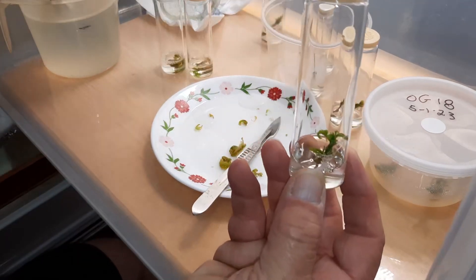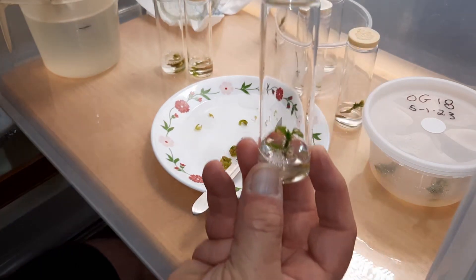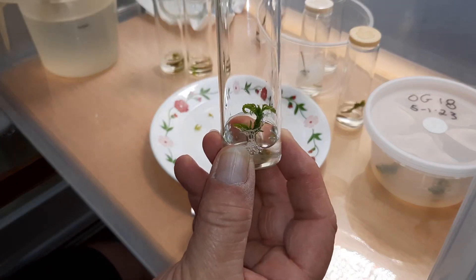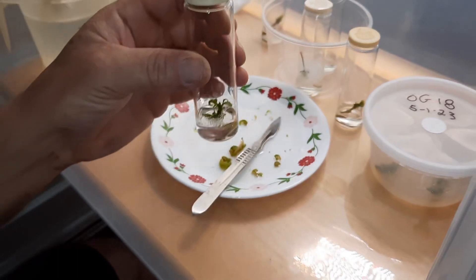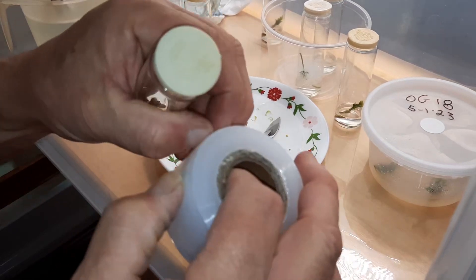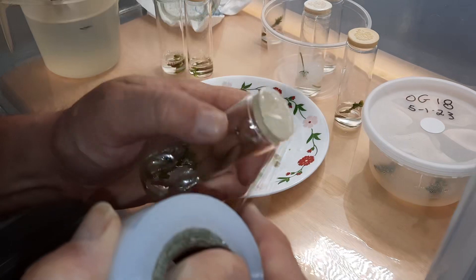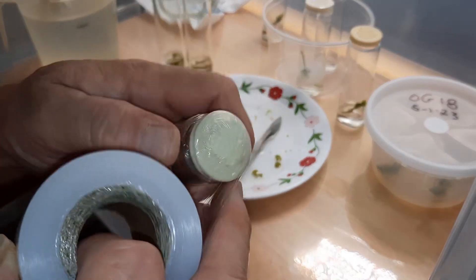Cute little things. This is OG number 18 — it's an old school strain and it was started on 5-1. One more thing besides labeling it: wrap it in grafting tape or parafilm. Grafting tape is a lot cheaper.